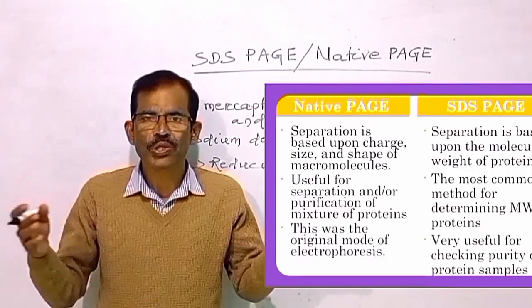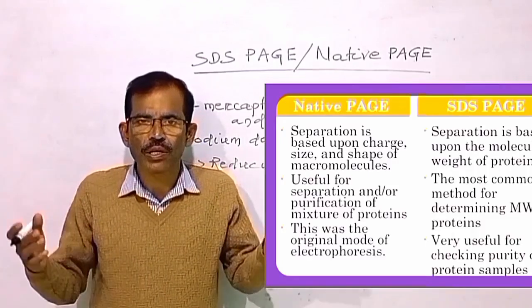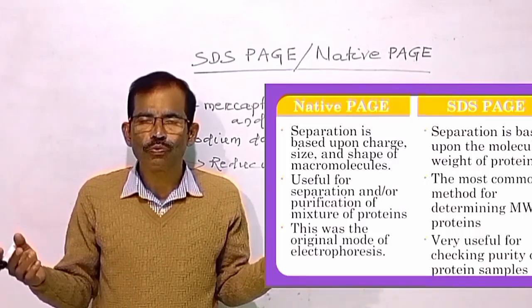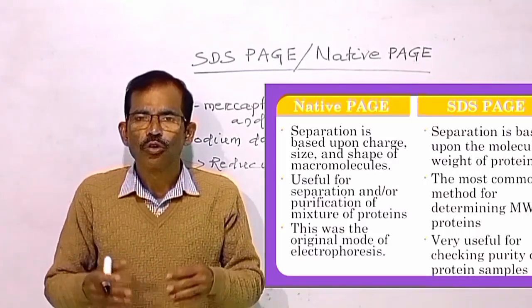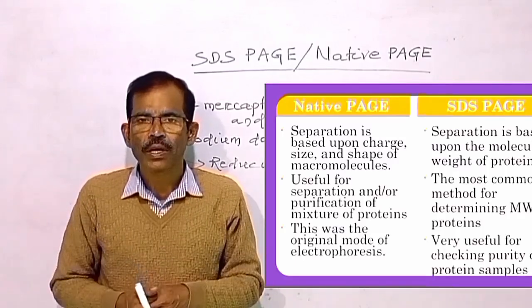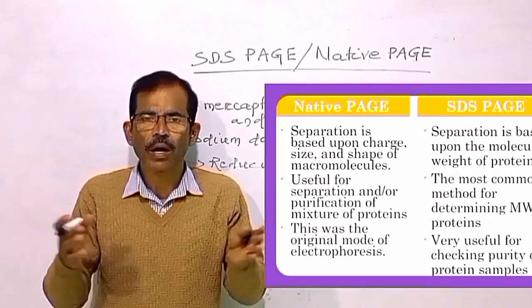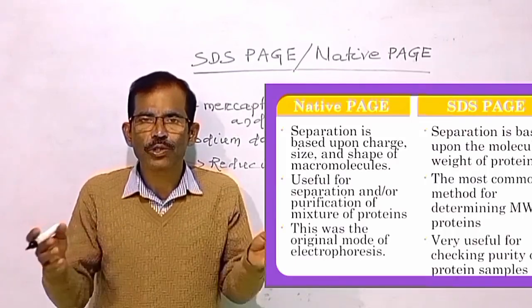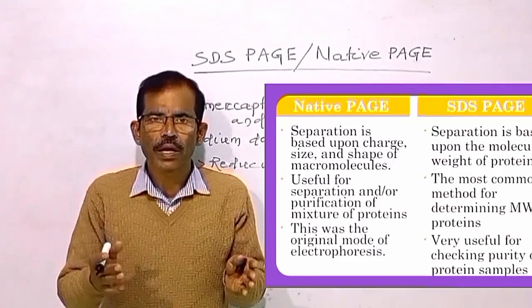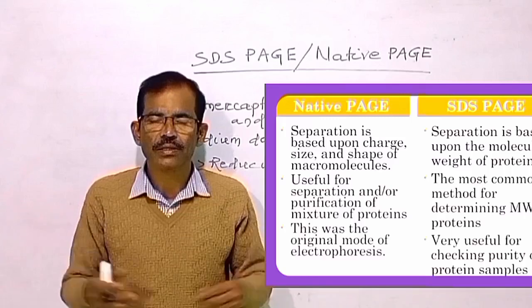In addition to screening out an enzyme in a complex protein mixture, native PAGE is also useful for the detection of fluorescent labeled proteins in a gel, and also for the determination of the native mass and oligomeric nature of different proteins. SDS-PAGE fractionates proteins only based on their size.